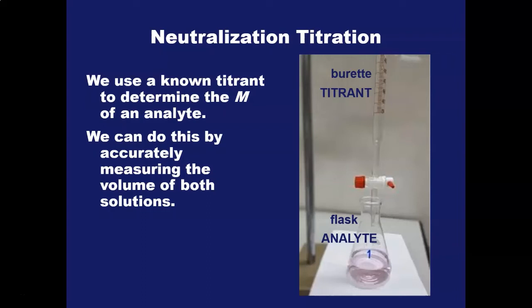First we're going to do this by very accurately measuring the volume using a burette for the titrant. So the base, the sodium hydroxide solution, will go in the burette, and we'll carefully read that to two decimal places using the graduations on the burette. And our unknown acid is going to go in the flask.